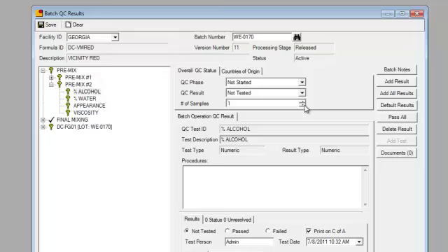The idea behind it is that the more times a sample or a batch comes through the lab, the more expensive it is for the company manufacturing the product, because typically if it has to come through multiple times, that means we're making adjustments or changes to the batch, making it have to cycle back through the quality lab. This field is saved on the batch QC header table and could be reported and viewed through VicinityView.